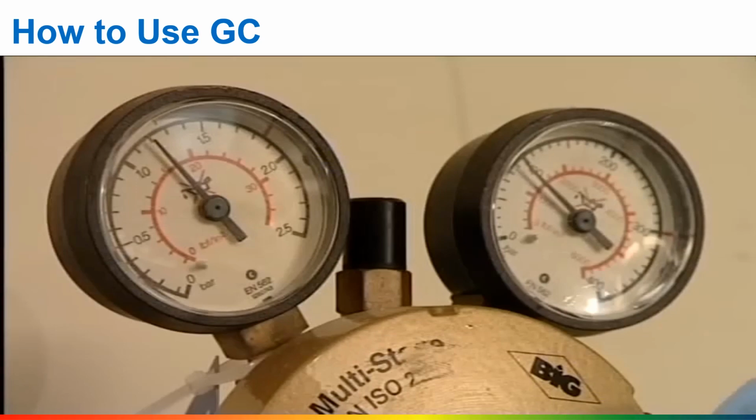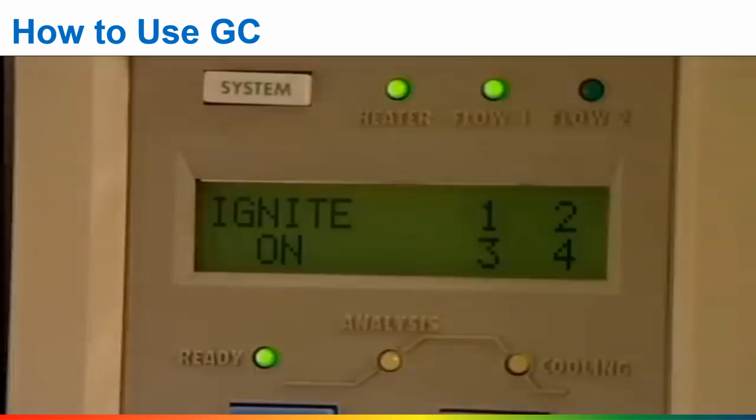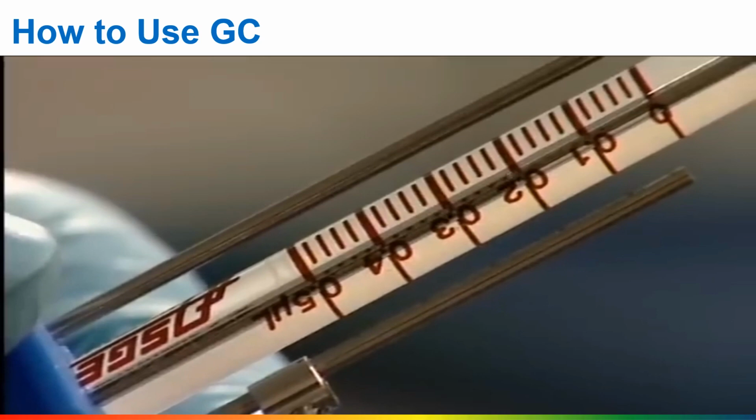Before beginning a separation, the operator must set the flow rate of the gases and the temperature of the oven. The temperature of the inlet port is also set at a level that ensures that the sample is fully vaporized, and the flame ionization detector must be lit. Here, we will separate a mixture of methanol and methyl benzene. About 0.1 microliters is taken up in a hypodermic syringe. It is then injected into the inlet port through a self-sealing rubber disc called a septum.